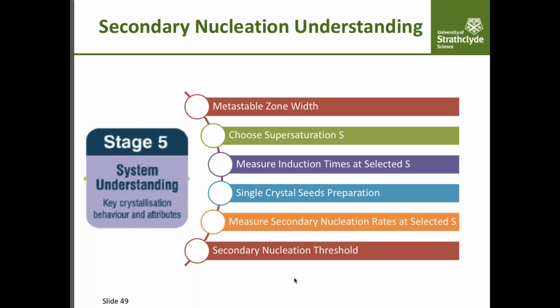Once you know the induction times and you have a process window to do single crystal seed experiments, you can measure the secondary nucleation rates at the selected supersaturation and possibly determine a secondary nucleation threshold. And this can be used to further design your crystallization process.